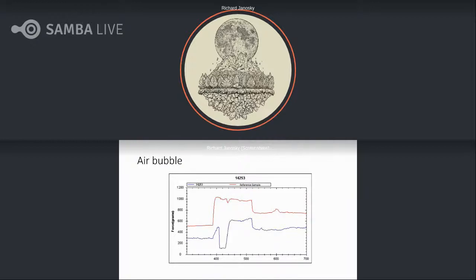So here we have an air bubble in the middle of the graph in the blue line. When that depression drops off and then comes back up, in the software, which I will review later when we run a sample, we have the ability to go in and remove the points on the graph right here, and they will not influence the GTI calculation. And then we will make sure that we are avoiding that influence of the air bubble, where there's no force required because there's nothing to push on in the grease thief.